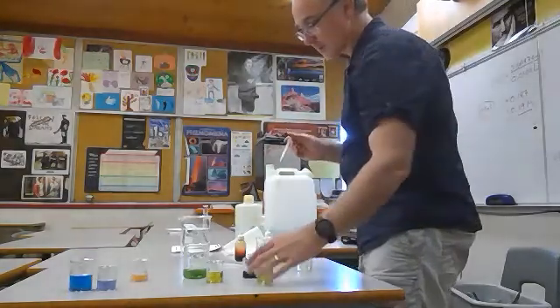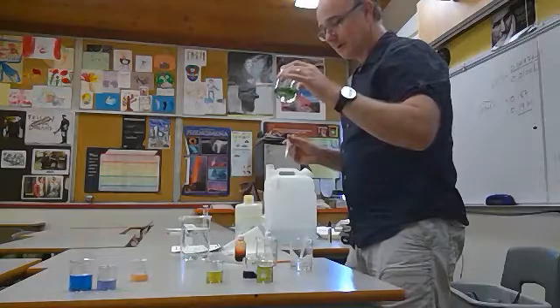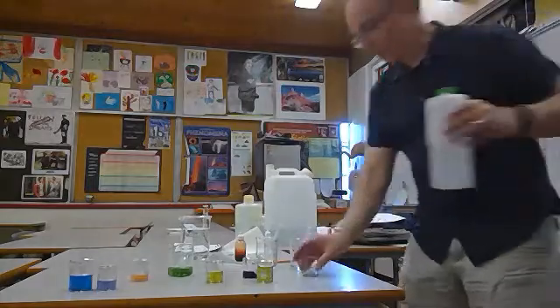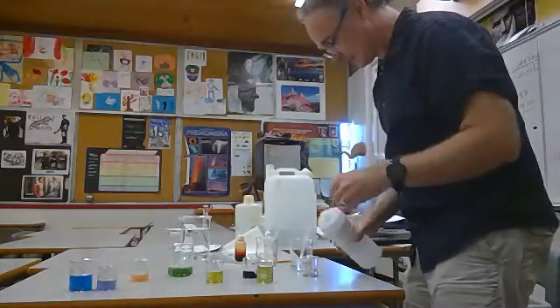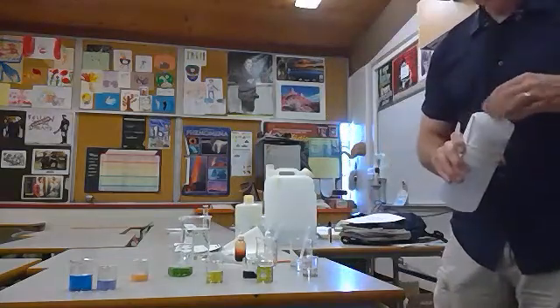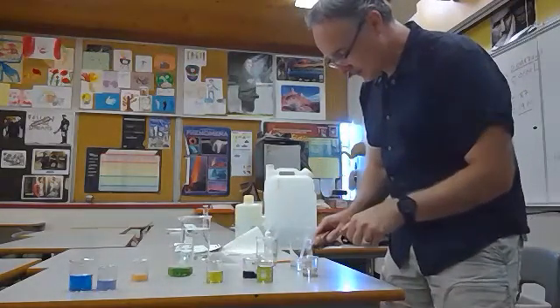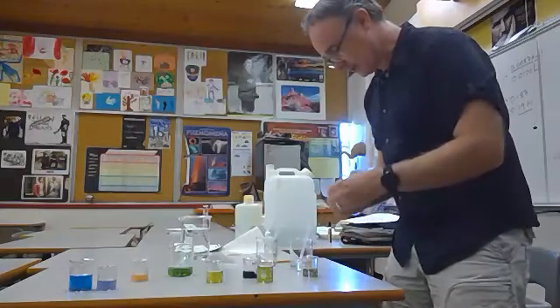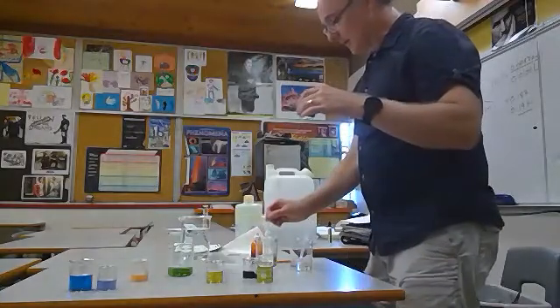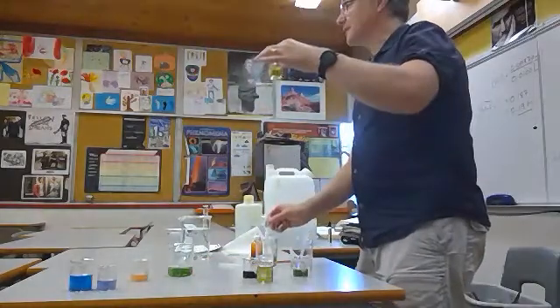And so I'll just take my original sample. This is just the buffer. That was the buffer. Just do one more buffer in here. So there's my buffer with some universal indicator. So buffer with universal indicator green again. And once again, I can add, if I take, this is the stuff I breathe acid into, right?